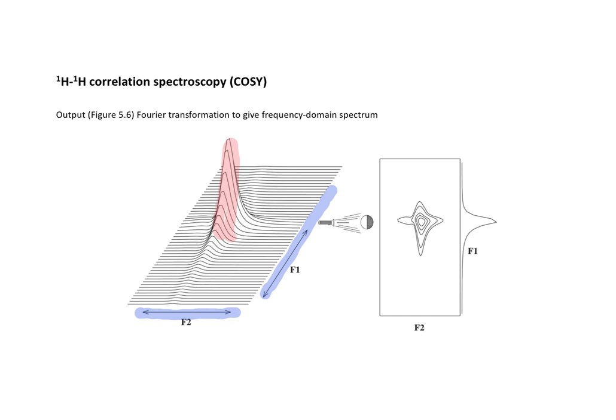Typically, this three-dimensional plot on the left is viewed as the two-dimensional plot without an indication of intensity, but that is separately obtained in a traditional one-dimensional spectrum by integration of the intensity of the proton resonances. This is the plot for a single resonance for the entire spectrum of a compound.